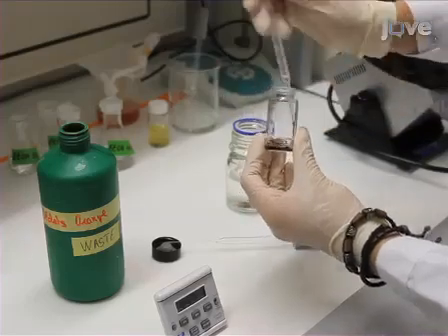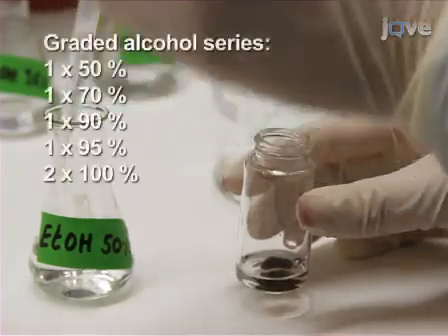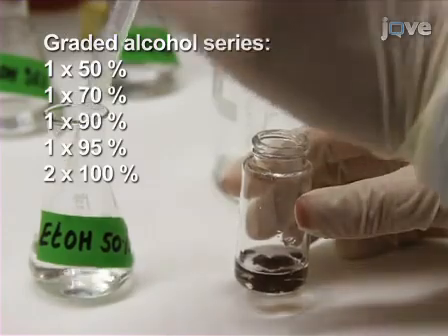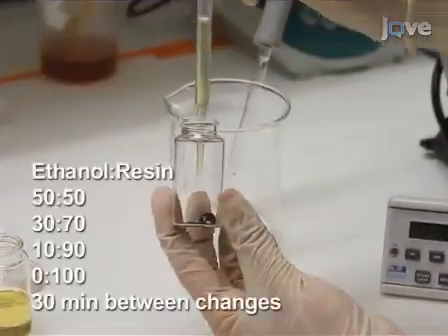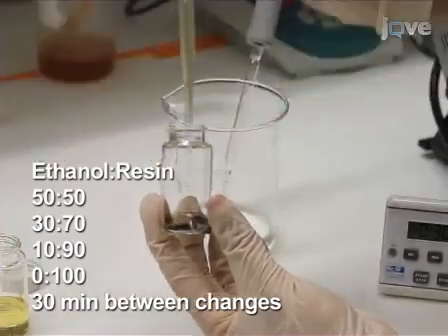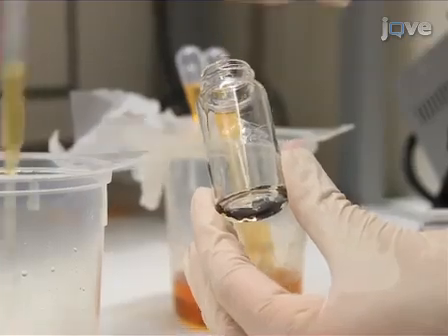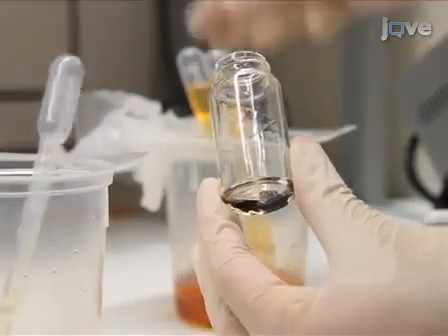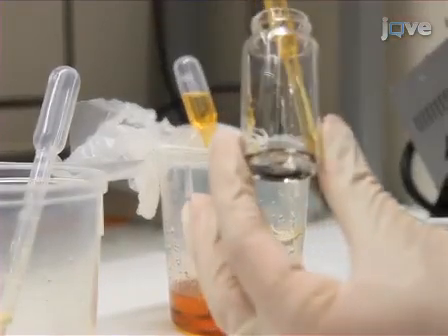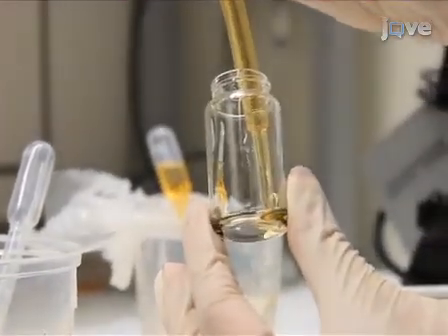Next, rinse the sections for 5 minutes in double distilled water and then dehydrate them in a graded alcohol series, allowing 2 minutes for each change. The next step is to embed the sections in increasing concentrations of Durcupan resin mixed with alcohol, allowing 30 minutes between changes. Start with 50 to 50 ethanol to resin, then 30 to 70, then 10 to 90. Finally add the sections to 100% resin for 30 minutes.